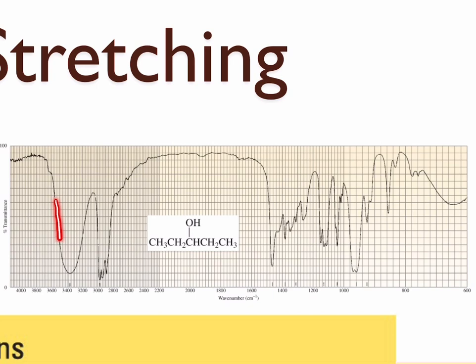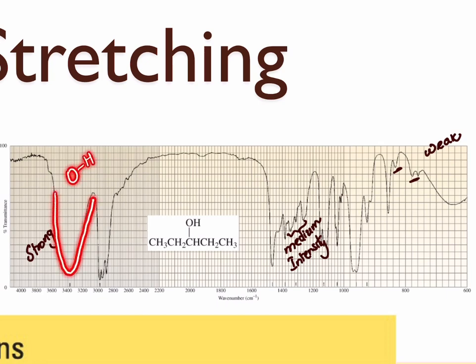Now these bands that lie close to the bottom of the IR spectrum are called intense bands, strongly intense bands. So they are going to have strong intensity. These bands right here which are lying in the middle are said to have medium intensity. And these ones which are on the top are said to be weak. Also there are some bands which are broad. For example, the OH peak produces a very broad signal, and that is because of hydrogen bonding. We'll talk about that later. But there are also some absorption bands which are very sharp. For example, this absorption band right here is sharp.